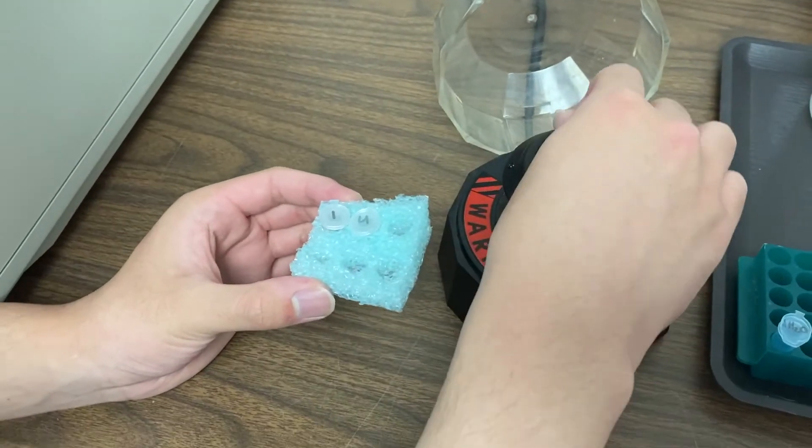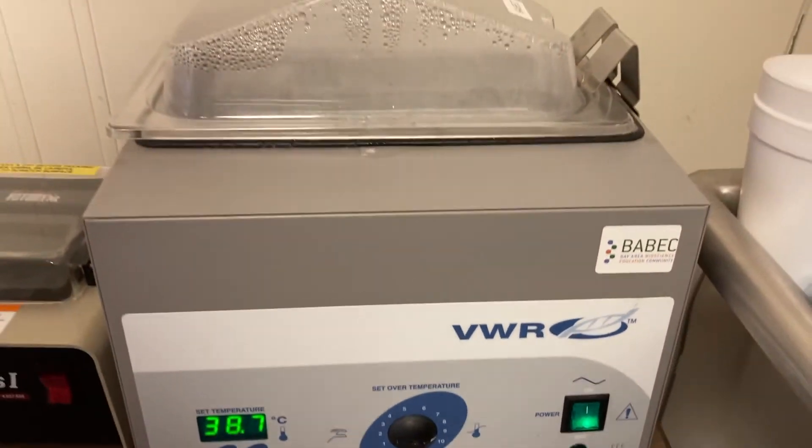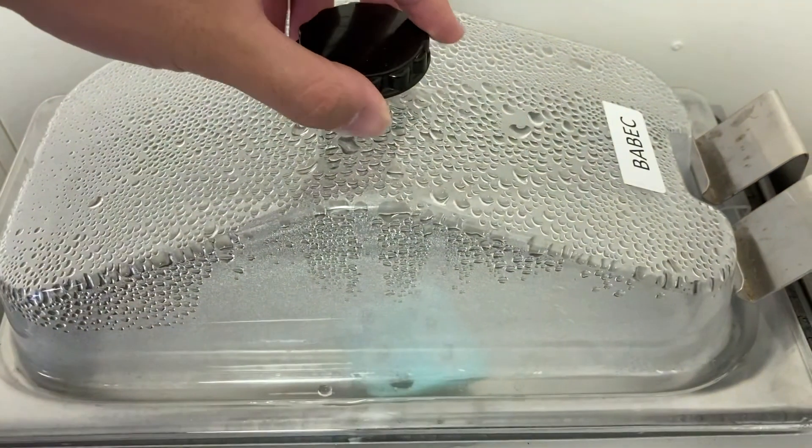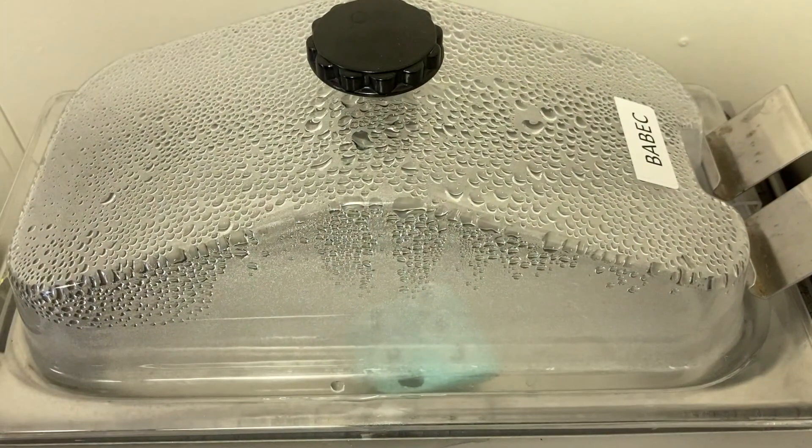Then we'll place our samples in a Styrofoam floaty for the last step of the Restriction Digest, which is simply to place your samples in a 37 degrees Celsius water bath for at least 10 minutes.